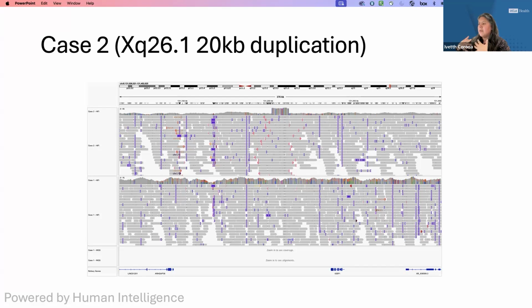It just shows how important communication with the referring physicians is. As analysts, we read every detail, all the information that they give us, so we can focus our analysis on that. If I hadn't listened to that, and I had just started with a genome-wide analysis, I would have missed this, because it's very hard for me to resolve these regions that are intergenic.